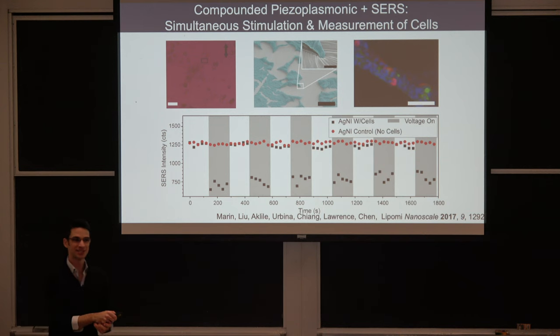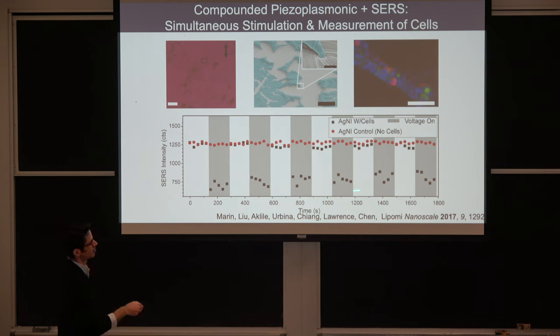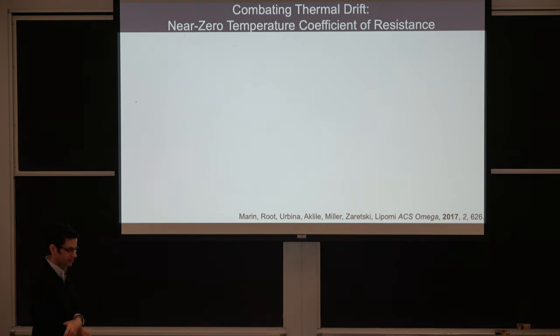Now notice that there's an upward drift of this bottom signal. That's because for as strong as graphene is, the myoblasts are stronger, and they're literally ripping it apart with every contraction. So this is actually a degradation over time. We'd have to find some way to stabilize the graphene using microfabricated structures. But this is a really interesting thing. I can't actually believe this worked. It was just kind of an idea my student had, and a couple of weeks later, it actually did work.